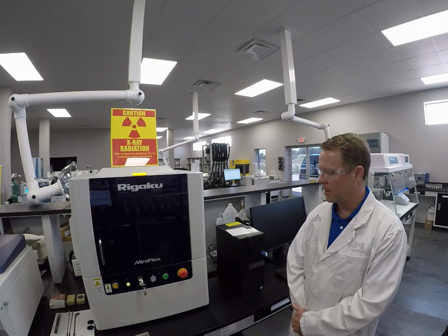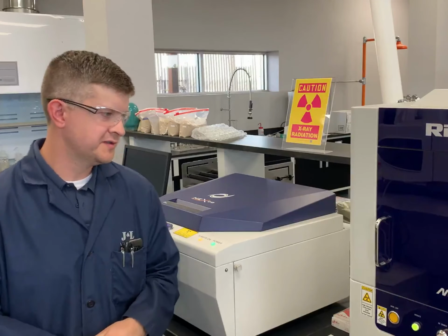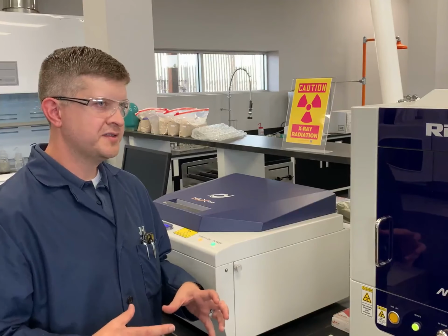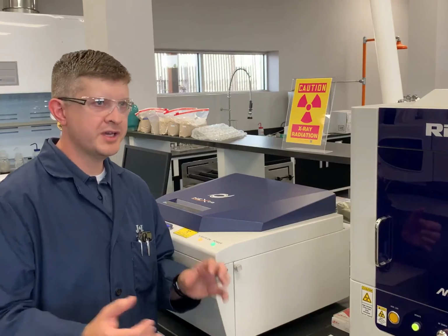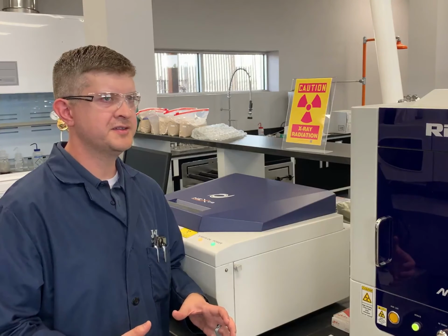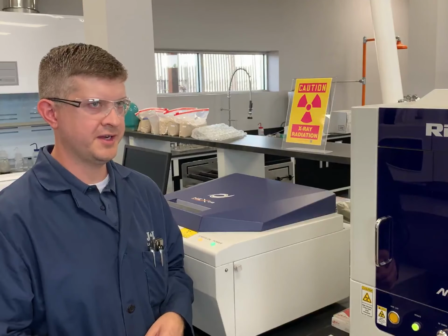And you were going on to the XRD. Yep, so the XRD is going to be the other part of the equation for our solids analysis. So this is going to give us our cations. The XRD is going to give us a full molecule. But it's not such an easy interpretation. It's going to give you several hundred possible things that could be inside of your solid sample. And the only way we'll know what it is is by combining the wet chemistry with the XRF data and using that to help us interpret the XRD's data.